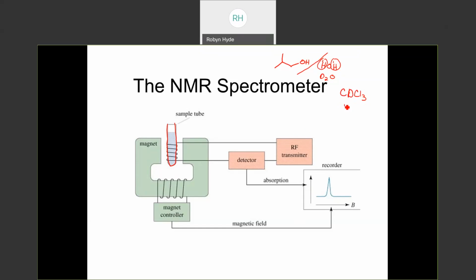So we use deuterated chloroform, instead of CHCl3. How many hydrogens have had to be replaced to form this deuterated solvent? Just one. And so it is not very expensive because chemistry has only been required to replace one hydrogen. Deuterated water is quite expensive because chemistry has had to be done to replace two hydrogens, going from water to deuterated water. So we use CDCl3.